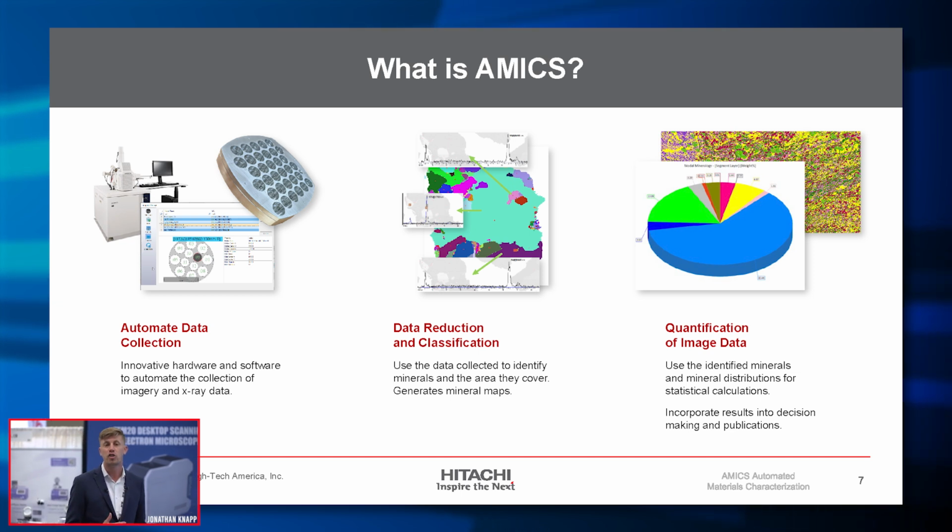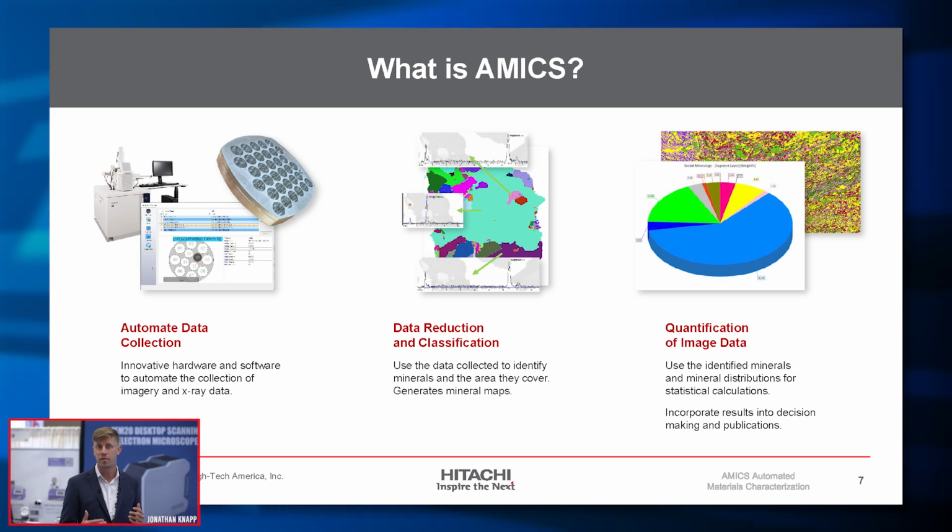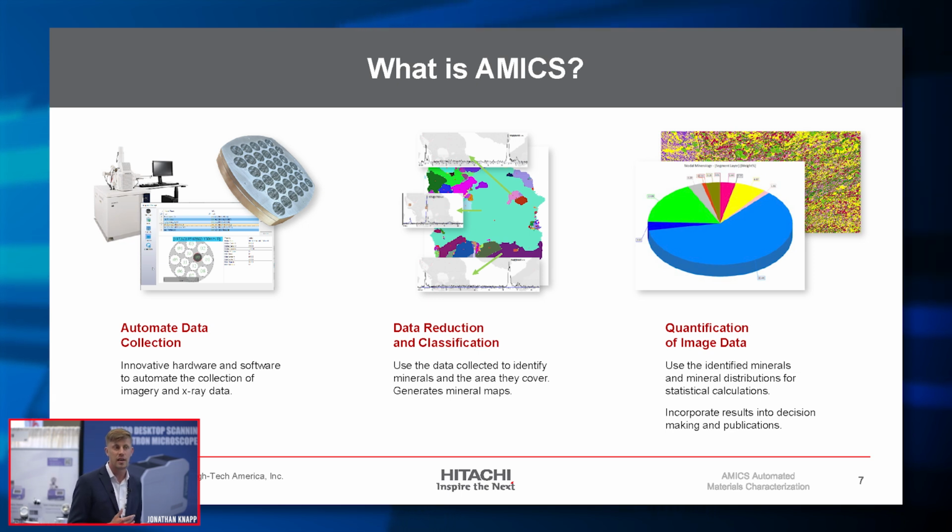It then has data reduction and classification. So the point is to take that EDS data and that image data and use those together to identify the phases that are in your sample. And finally, we have the quantification of the image data. So we want to translate that image and EDS data into numbers. Modal data, understanding its relative abundance, plus all of the textural data, things like particles and grains.